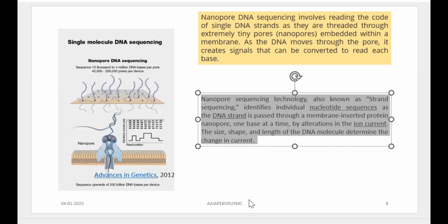So you are going to sense the presence of a single molecule, and that sensing is based on the basic molecular nature, size, shape, and the charge of the molecule. So when such a charged molecule of specific dimensions passes through a nanopore, 1 nanometer in diameter, its passing through that pore is going to be studied. How is it studied? It is analyzed with the help of deflection in the electric current.